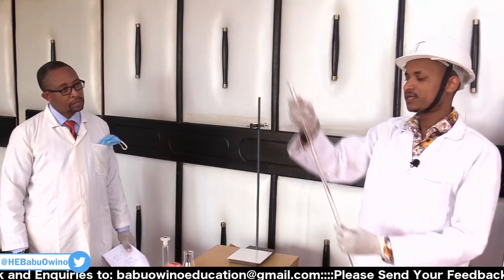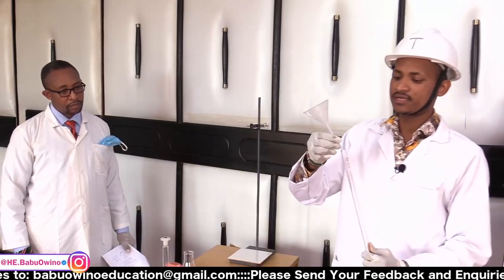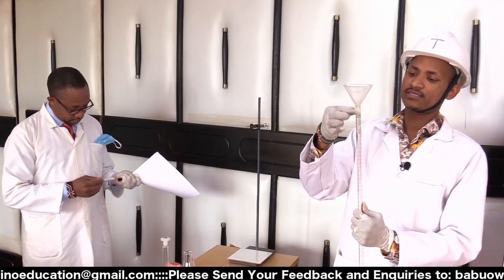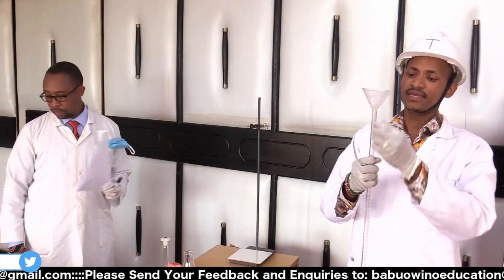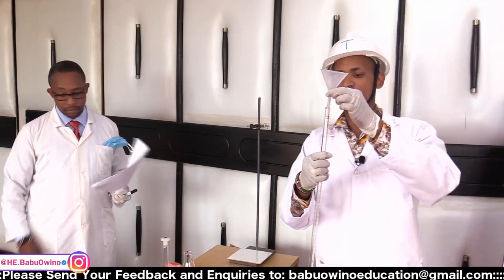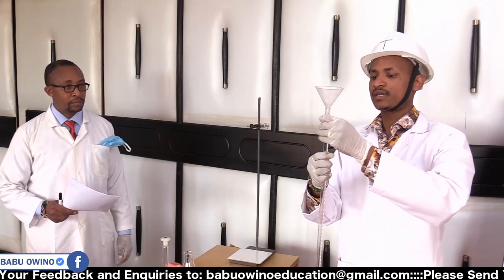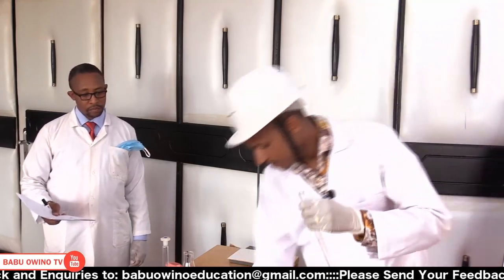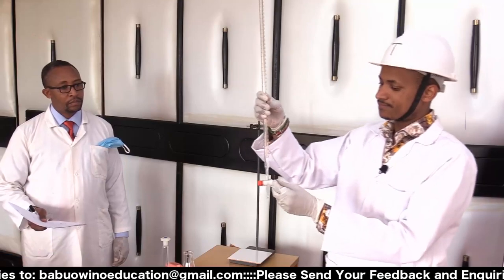Then you fill the burette using a funnel. We have a funnel here. When you are filling the burette, let the funnel not sit directly in it, but at least lift it slightly up. When you lift it slightly up, this allows atmospheric pressure to allow the filling of the burette using the funnel. Then after that, we have a tap.